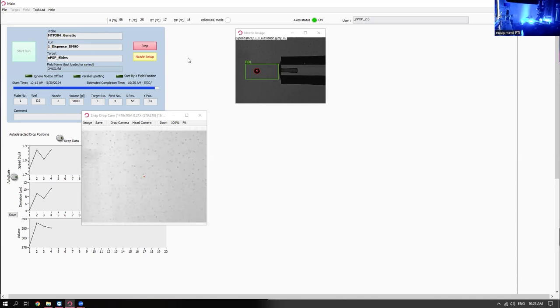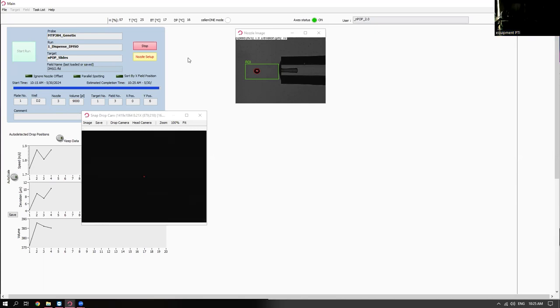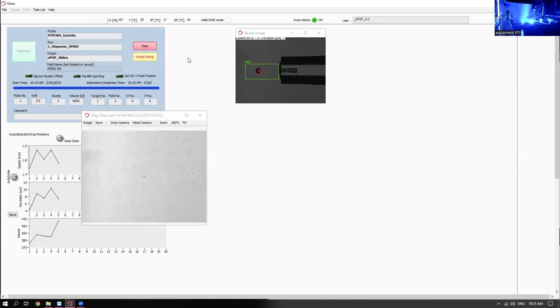As far as the cell line is concerned, there's not a big difference. I've seen that some of the fixation processes make the cells a little bit more transparent, it seems. And so you may need different settings to detect them robustly. But people use all sorts of different cells, and certainly fixation is something of interest. I have a couple of groups who are investigating different fixations for single cell proteomics, just to make processes easier and allow access to more sample types.